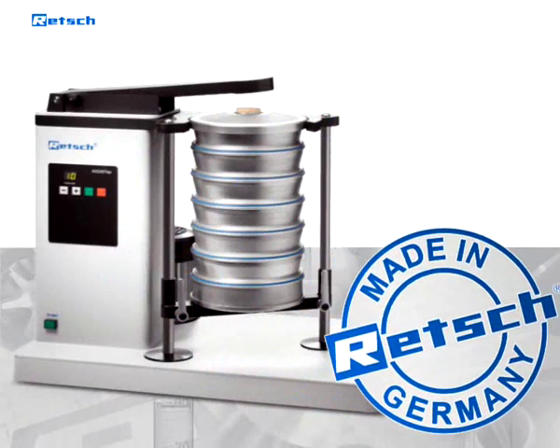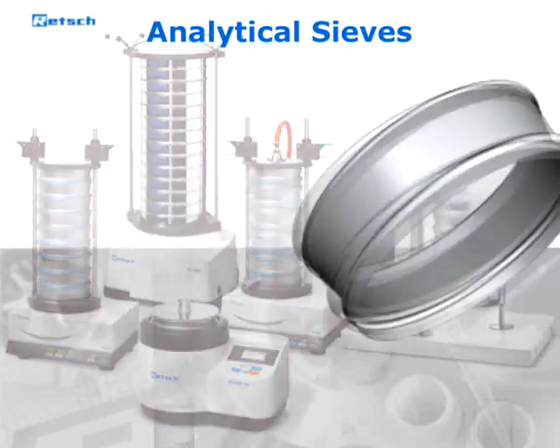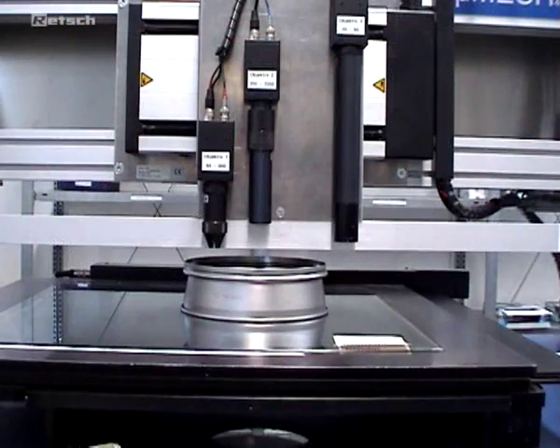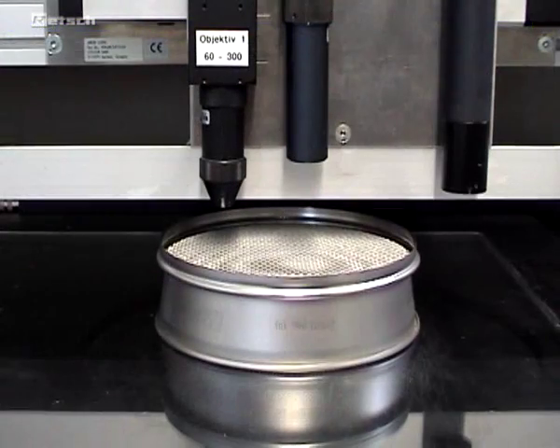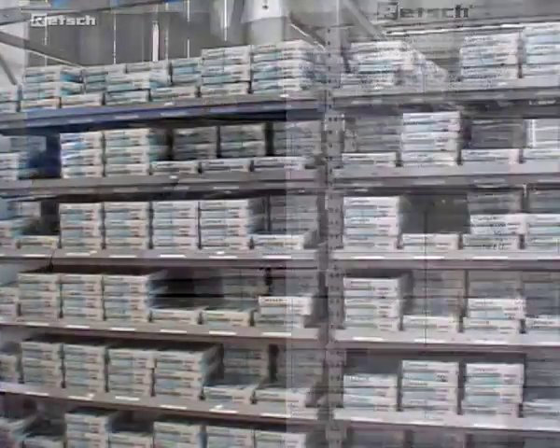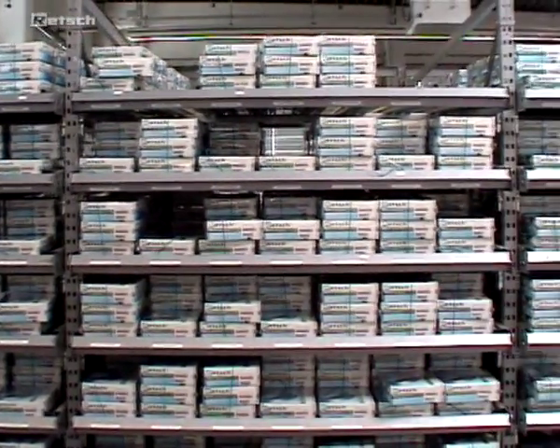Quality made in Germany. In addition to sieve shakers, RETCH also produces high-quality sieves. The fully automated production process and the thorough optical inspection allow for a previously unattained product quality, which is documented by a test report. The state-of-the-art production process guarantees the highest possible quality for each and every sieve.